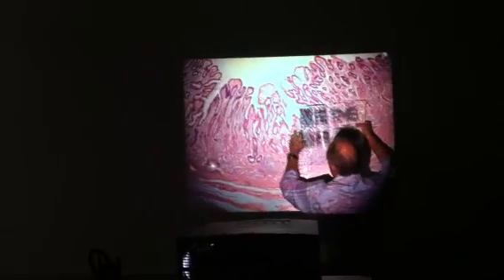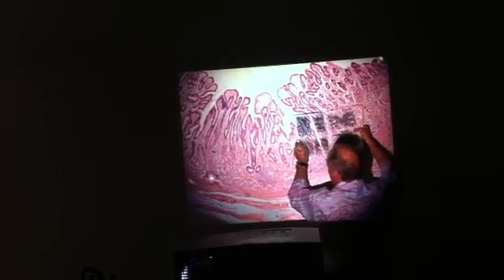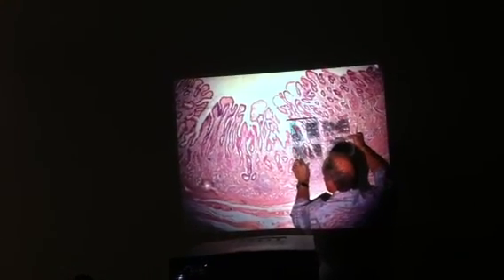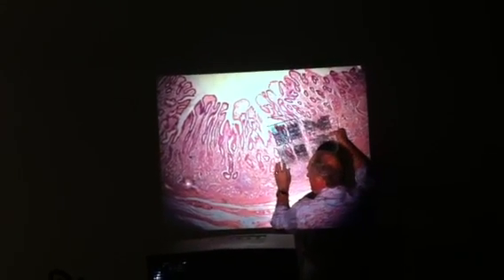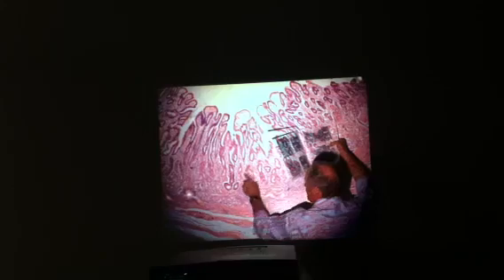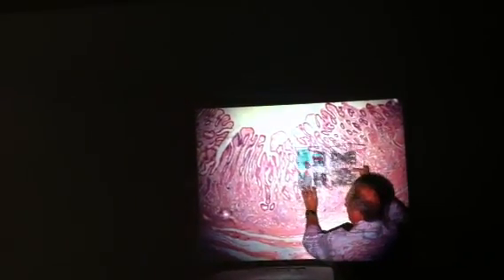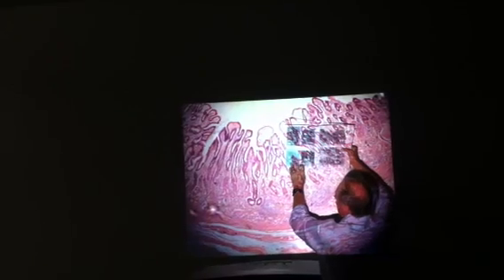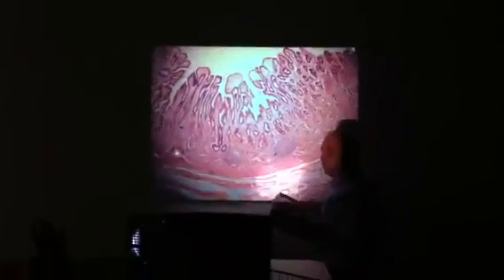Then the gastric pits: in 61C, you can see the gastric pits and the lamina propria, and down below he'll use the term pyloric glands. Remember I said these things like this are called pyloric glands. If you look again at Rust, right here, you can see pyloric glands down there. Any question? Y'all have a question over this now?